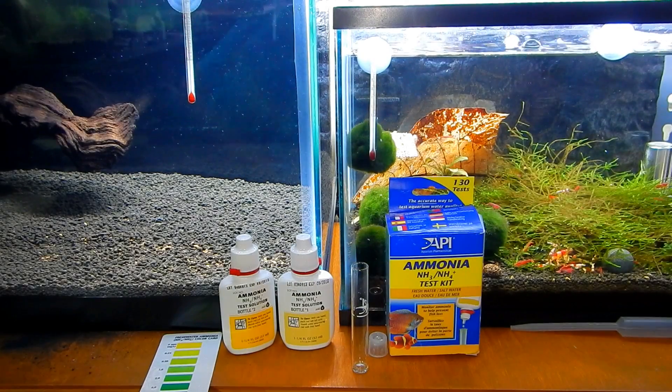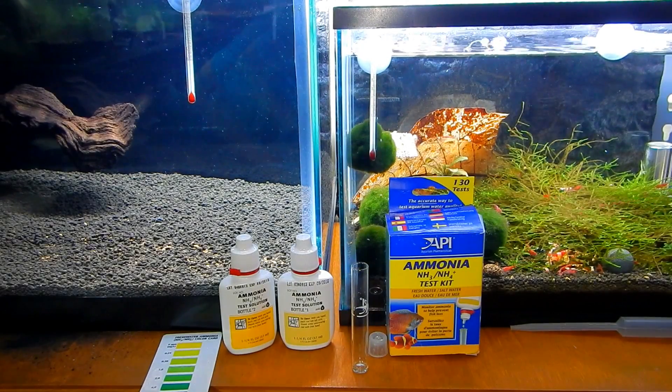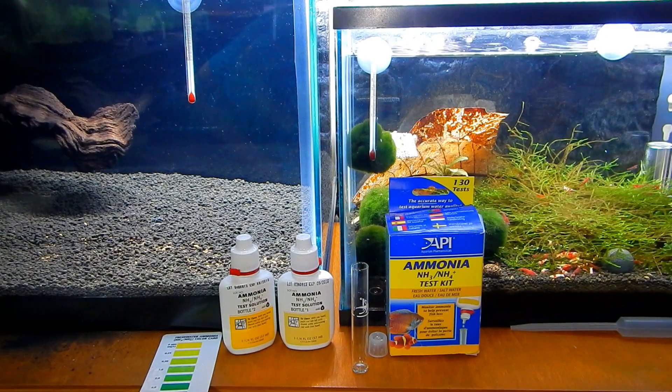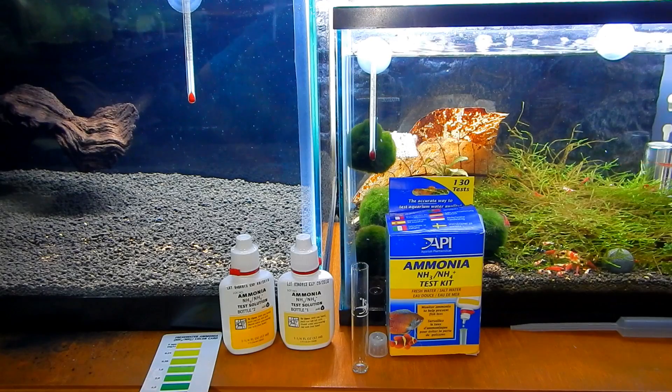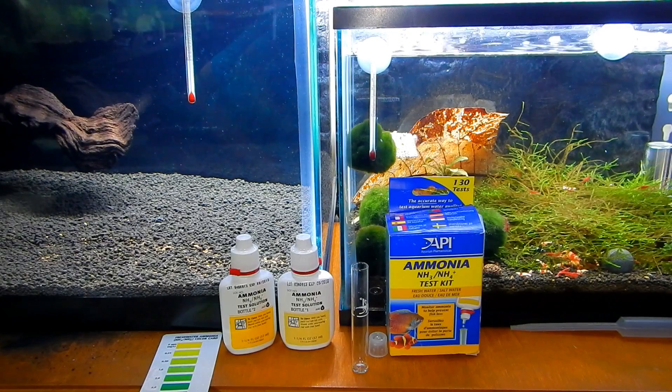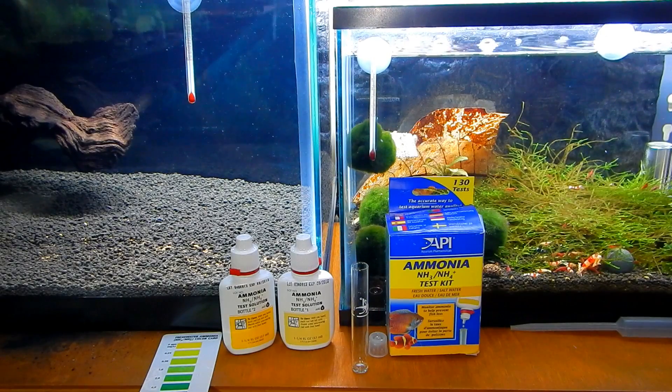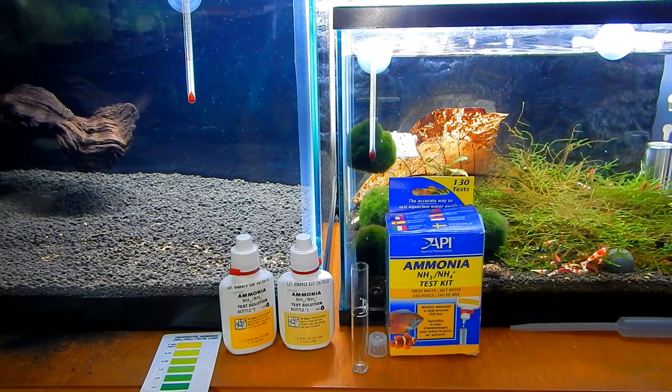Hello shrimp and fish people. In this video I want to show you how I test for ammonia in my shrimp tanks. The tank on the left that you see on the screen is a tank that I'm currently cycling. It's a 20 gallon long on my shrimp rack and it is at the stage where the ammonia is going to be really high. So I want to show you how I do this.